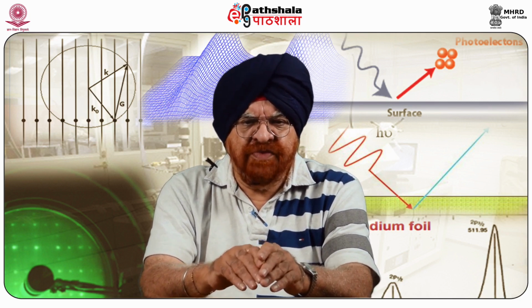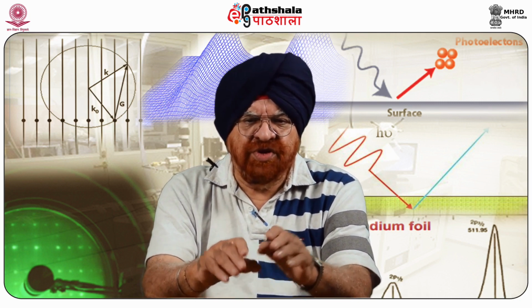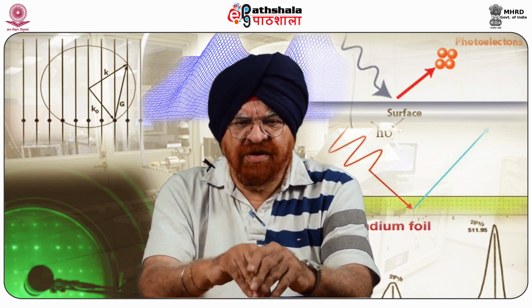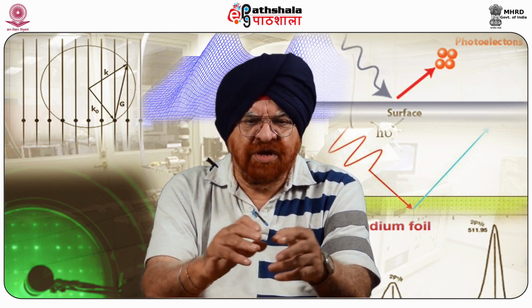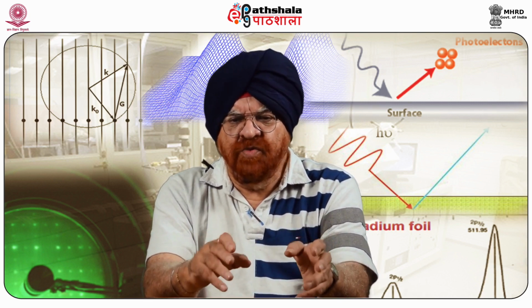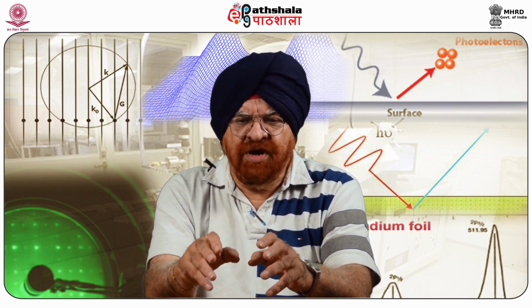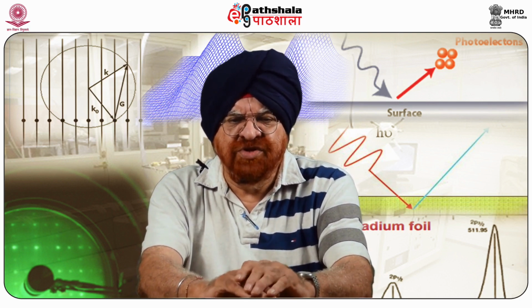An AFM tip can be prepared for high-resolution KPFM using any of several methods. The most common method is to take a commercially available heavily doped silicon cantilever and use heat treatment followed by argon ion bombardment to remove the native oxide layer and other contaminants from the surface, which makes the measurements rather easier.